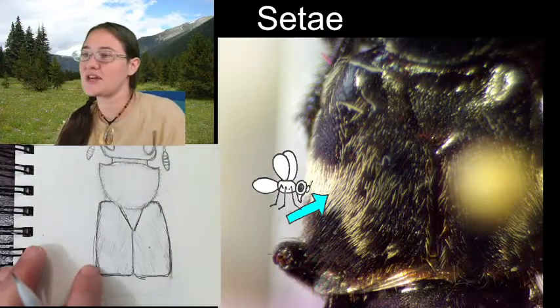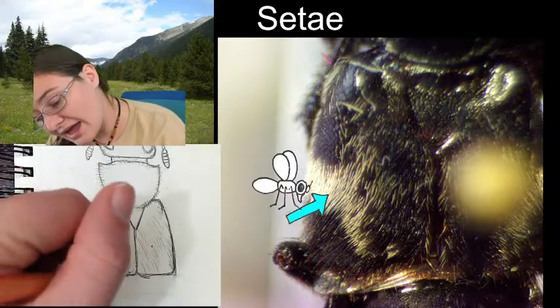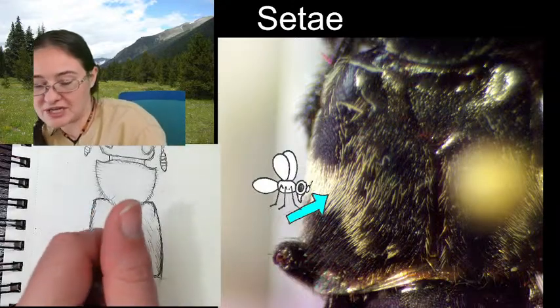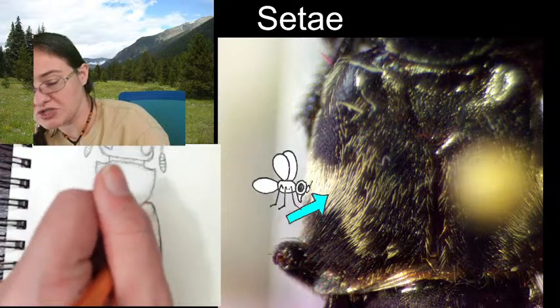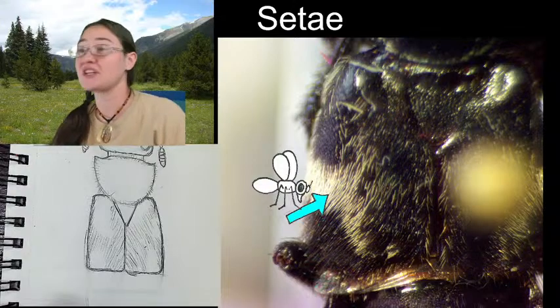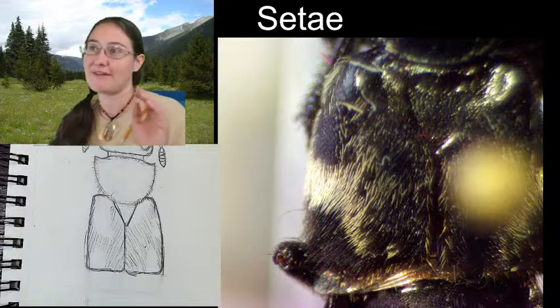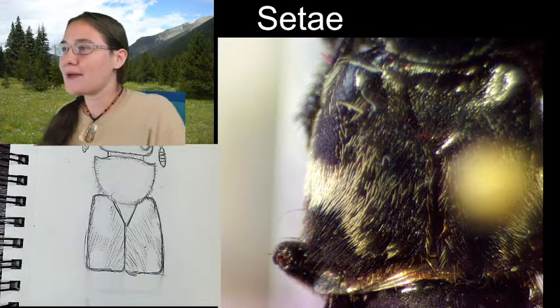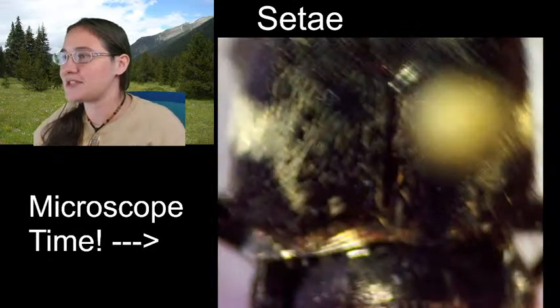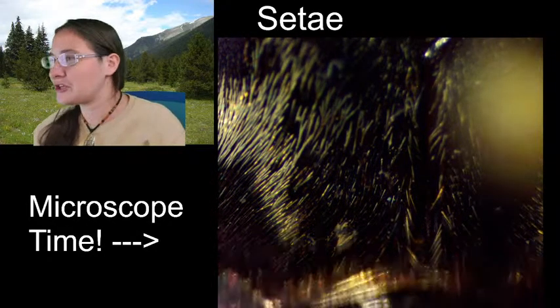Alright, so this gives us an idea of the patterning of the hairs on the elytra, and that may be important for the identification of the species, but most of the time for rove beetles, we just have to see that the elytra are significantly shorter than the abdomen. They're one of the only beetle families that have these very, very short elytra. I was hoping that if we zoomed in at the base of the elytra, we would be able to see some of the membranous wings tucked underneath. Kind of a little bit.